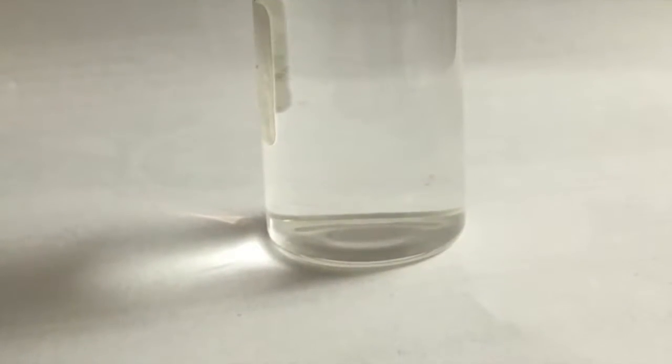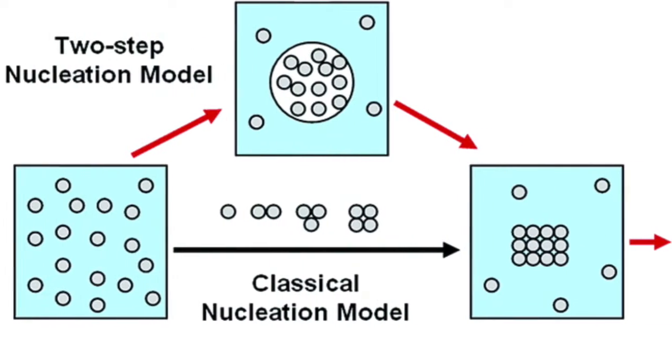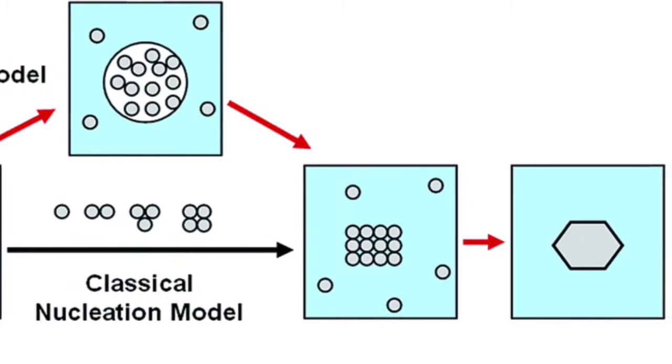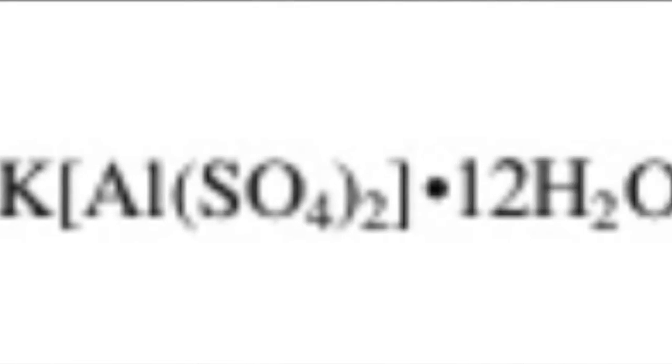Crystals were formed when a process known as nucleation occurs. Nucleation is a slow process, either spontaneous or induced by the vibration of particles, and is the basis of crystallization. As the water evaporates from the vial, nucleation will slowly occur, and a crystal will be formed.